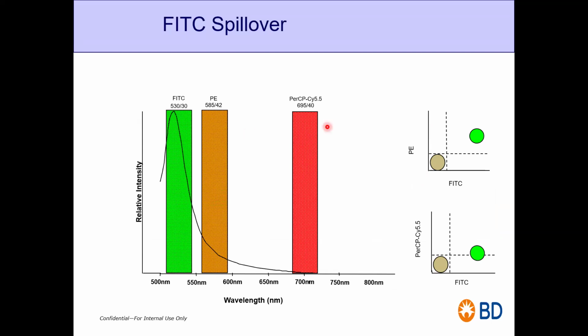So it should get only FITC signal, right? But as you see this, and now as you have given me a right answer for your CD3 negative, CD19 negative, so I'm understanding that you know the concept of this thing. So if this means it is your PE and FITC positive.